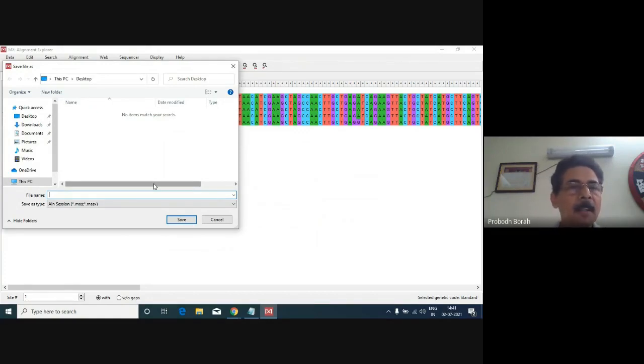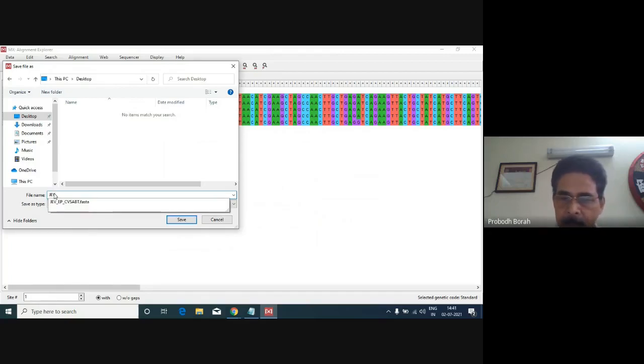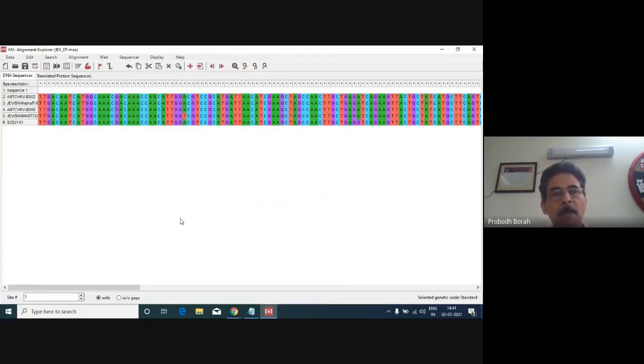So let us keep it on the desktop, then give a file name. Let us give it as JEV underscore EP envelope 14, JEV envelope 14. So click Save. Automatically it will be saved as a .mas file on the desktop.